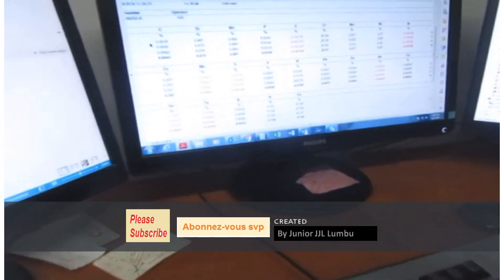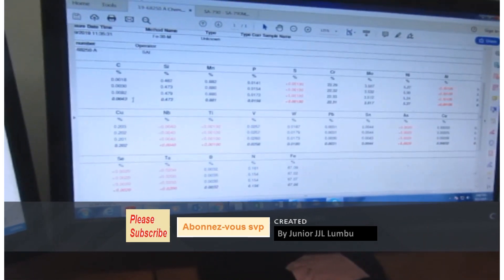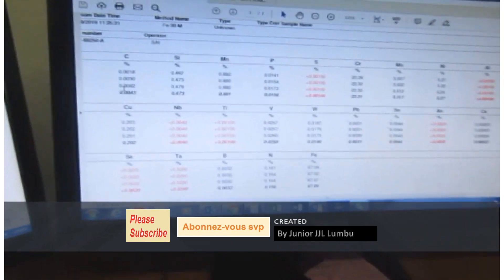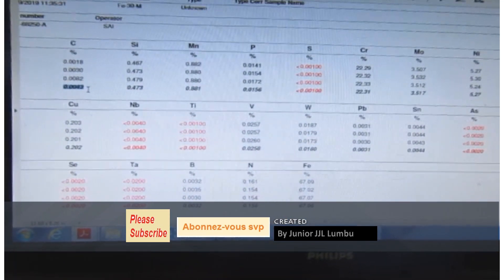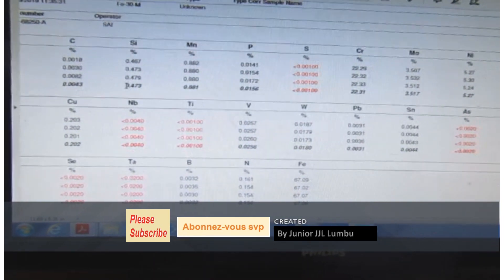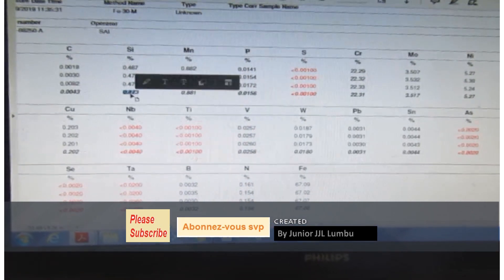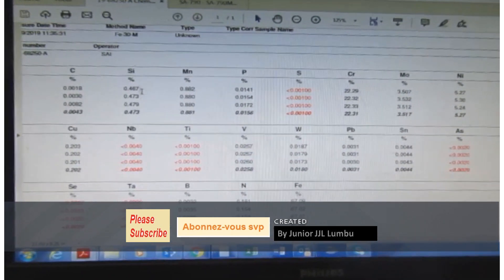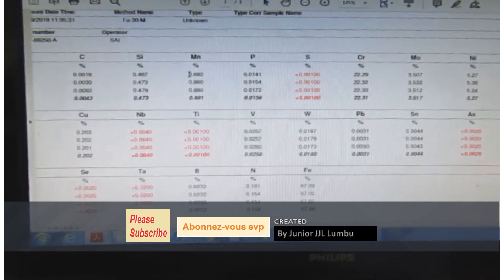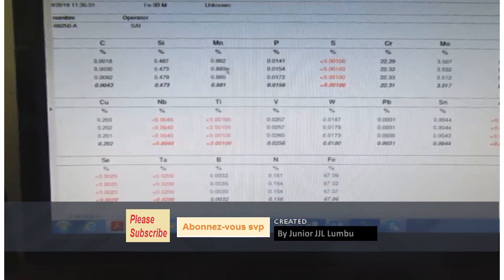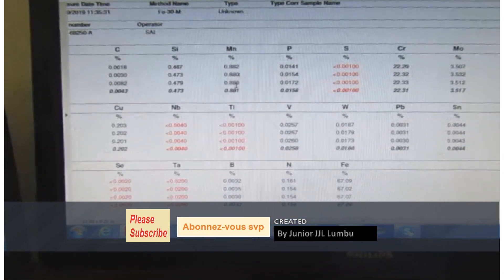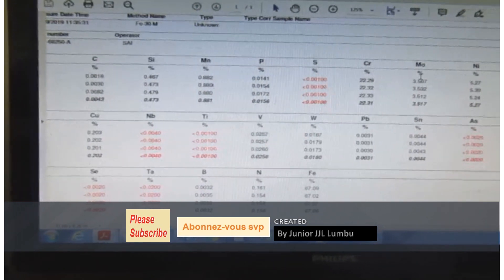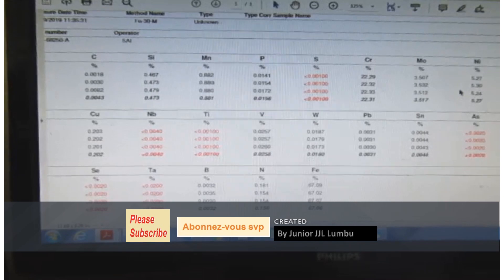This is a typical result of chemical analysis. After sparking, we got these results — this is the carbon content, this is the silicon content. The sample was sparked three times to get a consistent average. On manganese, the first reading was 0.882%, the second was 0.88%, and the third was 0.88% — very consistent. The same consistency applies to molybdenum, nickel, and other elements.